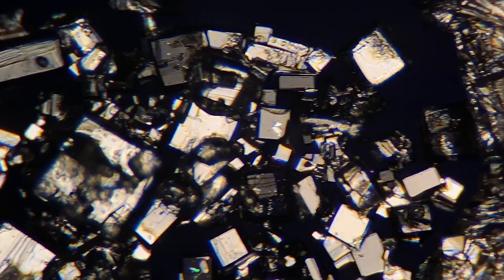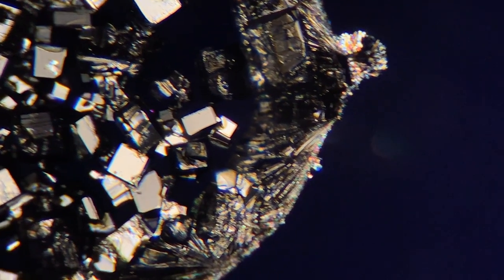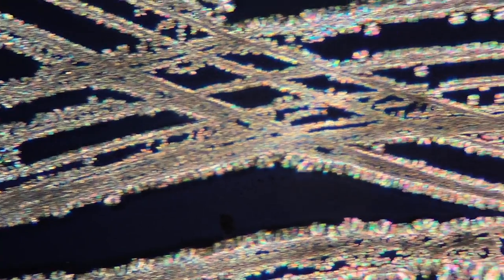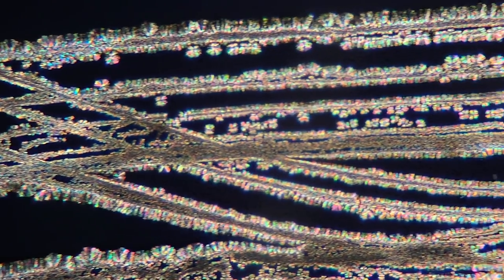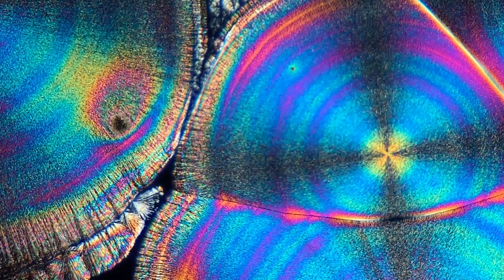Now before we get into the really cool art stuff, I wanted to show that some of the crystals can sometimes be a little bit too big, and on the other hand, sometimes they can be a little bit too small. So you want to create a concentration that's just right. With this particular slide, I was scratching the microscope slide to try to seed it and help the crystals grow, which they did in some cases. Anyway, let the art show begin!